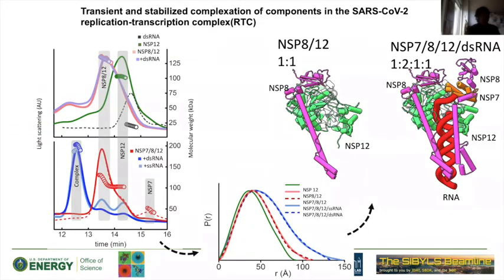And now an example for SEC-SAXS, before I go to a little more tutorial. I think I have a few minutes left. Over the pandemic, the beamline was not closed. We had minimal operation on our side. Thanks, Daniel, who was collecting data while all of us were sitting at home analyzing it.